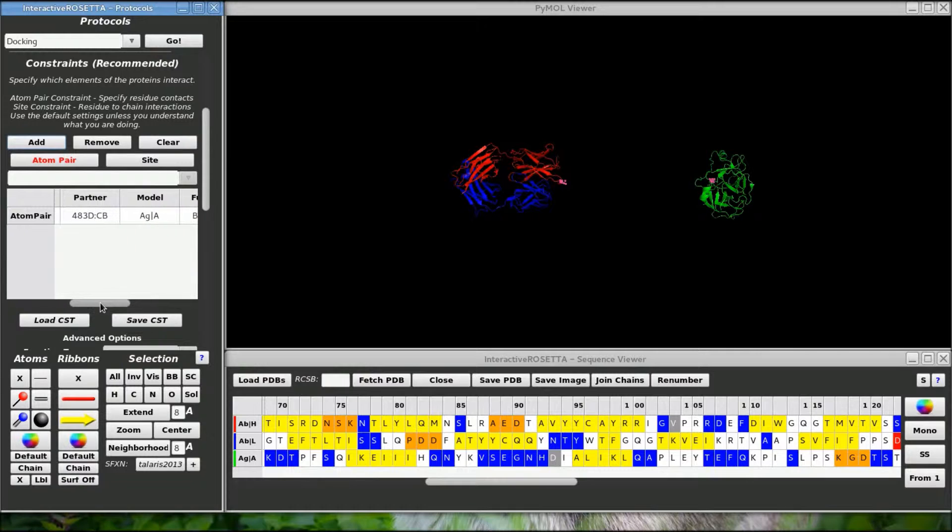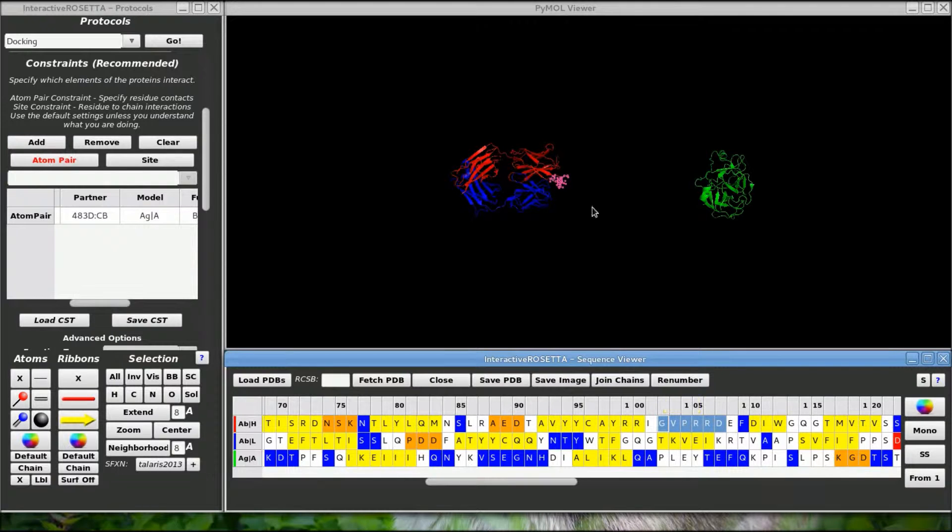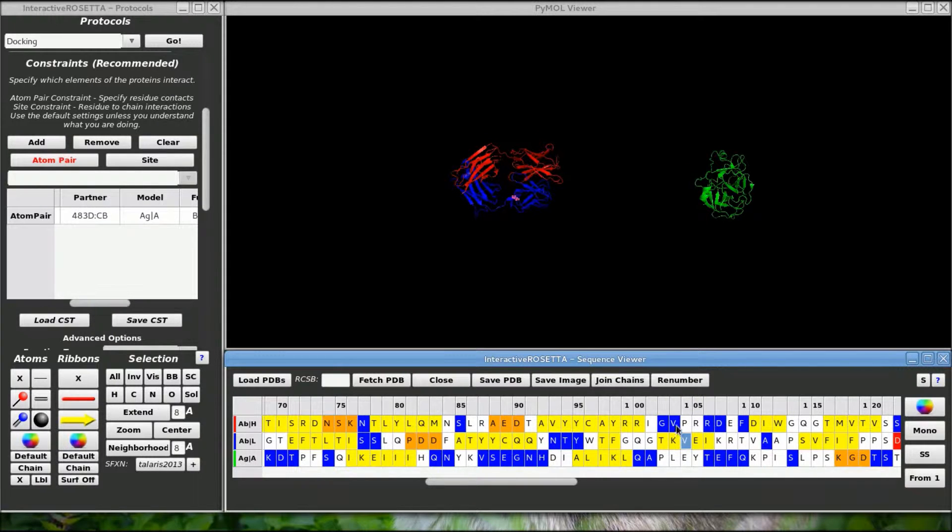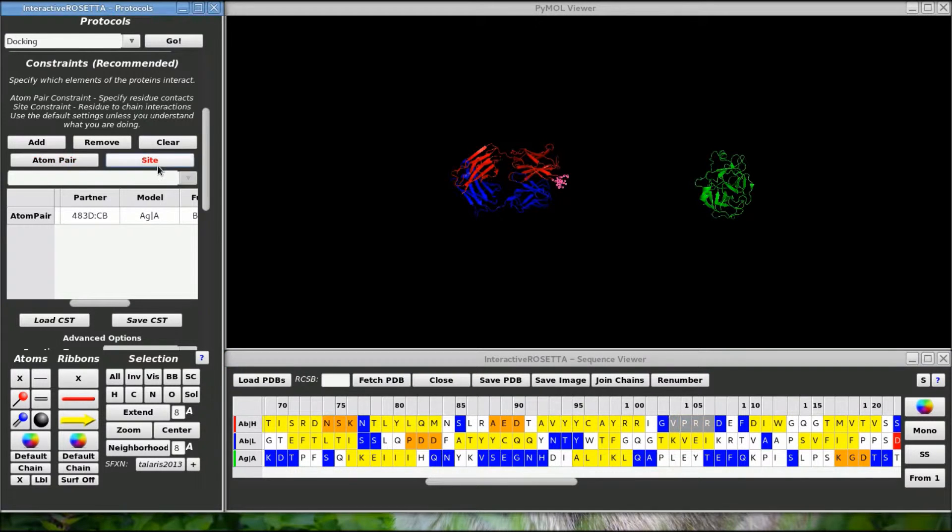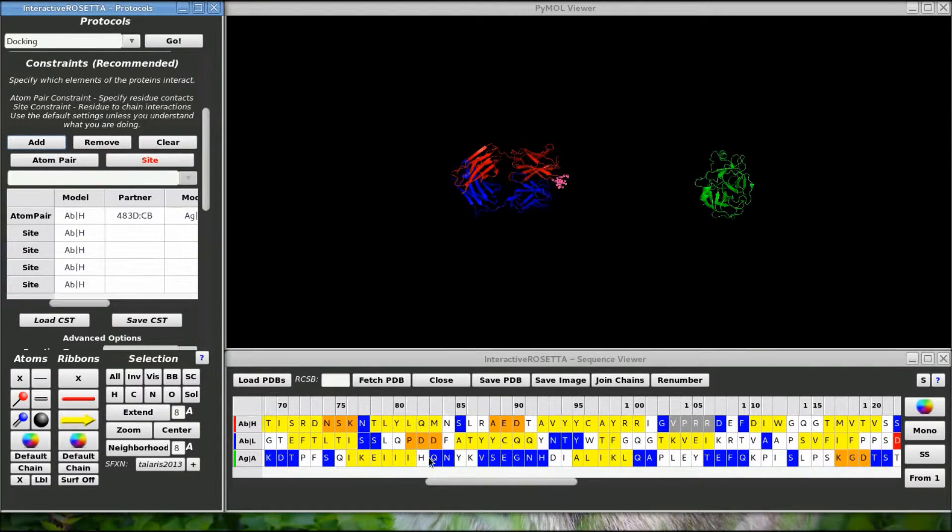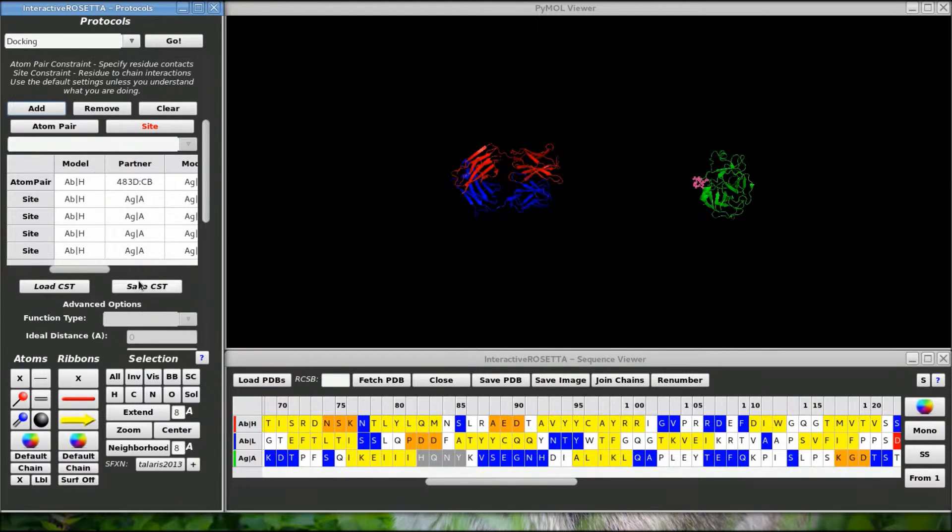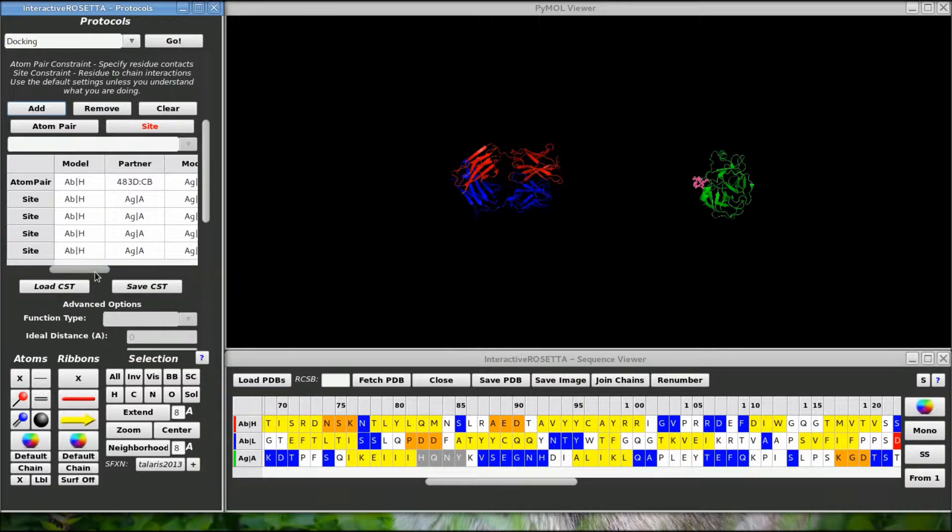Let's say I know the set of residues on the light and heavy chains will be interacting with the antigen, but I don't know where on the antigen they interact. So I can specify them as site constraints. Now I have to tell it to partner these residues with the antigen chain V. So let's select 4 residues on the antigen and then right click over here to fill in all 4 at once.